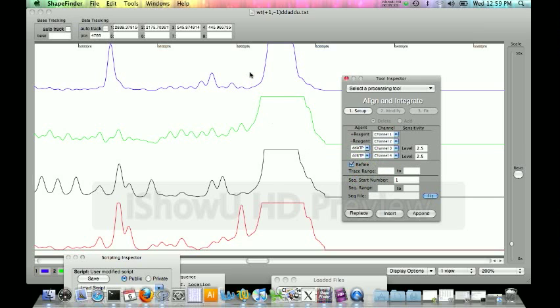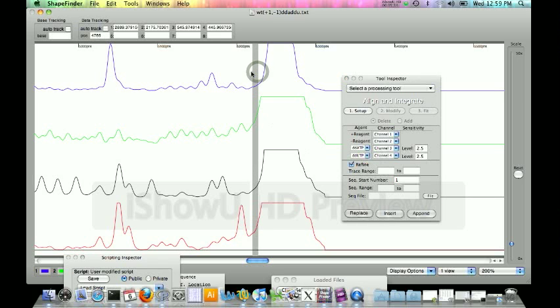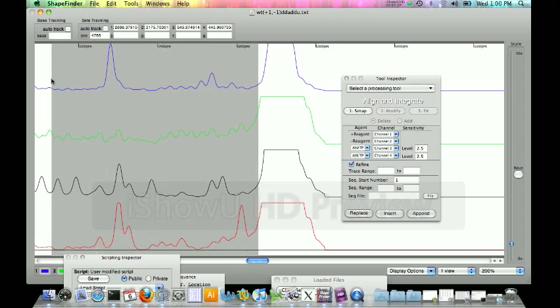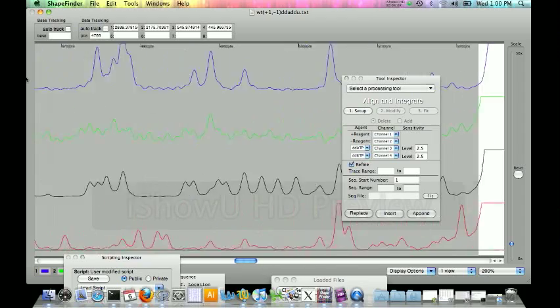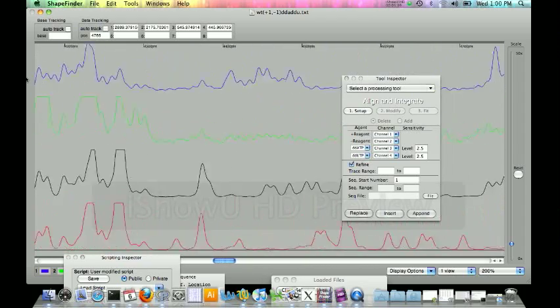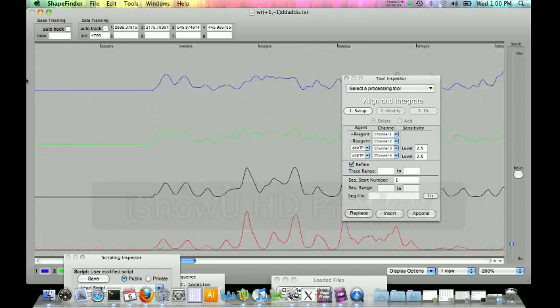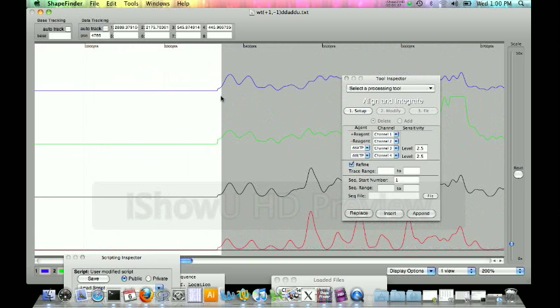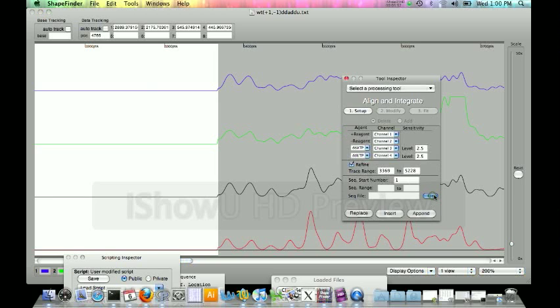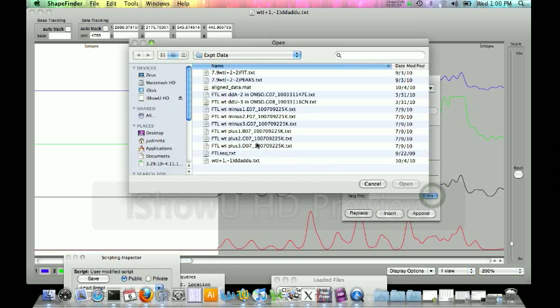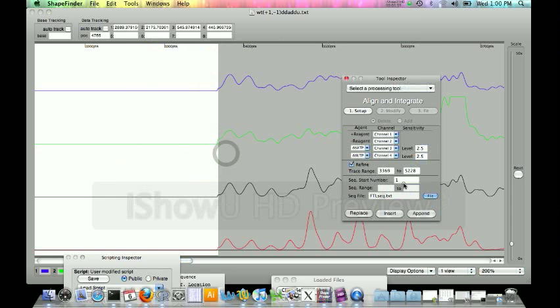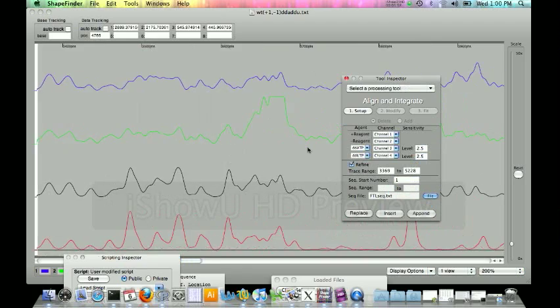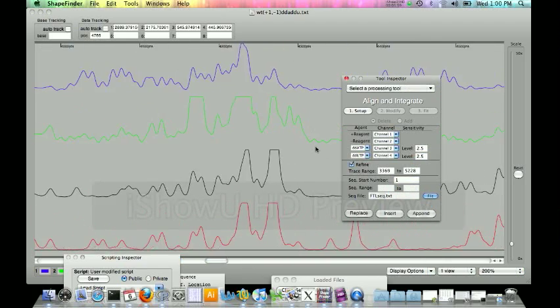Next you have to choose the range over which the data you want to be applied. You come right to the left of the primer front and go ahead and highlight the entire area where the data is. You'll see after the signal decay correction that the RT peak has been cut off and that's okay. So we're just going to go ahead and highlight the rest of our data. And the last thing you have to do is tell it what your sequence is. Now we're all set to use the align and integrate tool.